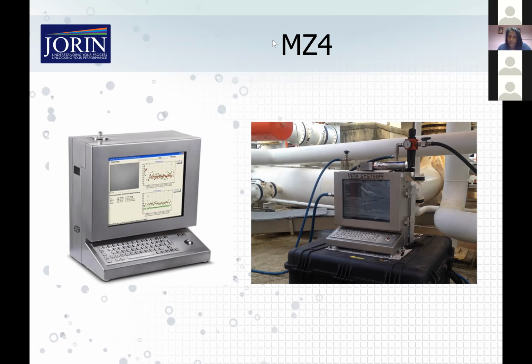The ViPA software itself is constantly monitoring the amount of light that we're transmitting. So we have fouling alarms. We have the ability to say this is in good condition, it's nice and clean. If fouling has occurred, we'll pause analysis, run a wash, and then check the light situation again, and then continue analysis if it's all okay.